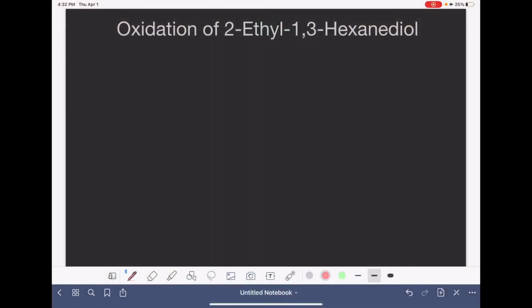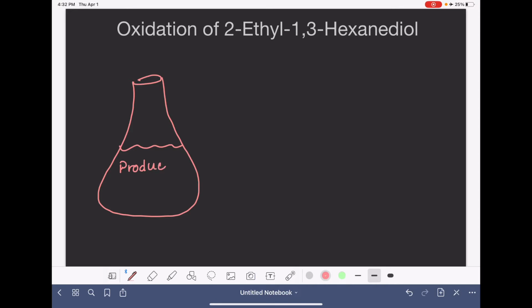At this point, the reaction is complete. All of the excess bleach has been neutralized using sodium bisulfite. All of the excess glacial acetic acid has been neutralized using sodium hydroxide. And now what I have left inside my Erlenmeyer flask is my product, and it is in water. All the water is there from the sodium bisulfite solution and from the sodium hydroxide solution. And then there's a lot of byproducts mixed in there as well. So my product with the byproducts, and all of it is aqueous.